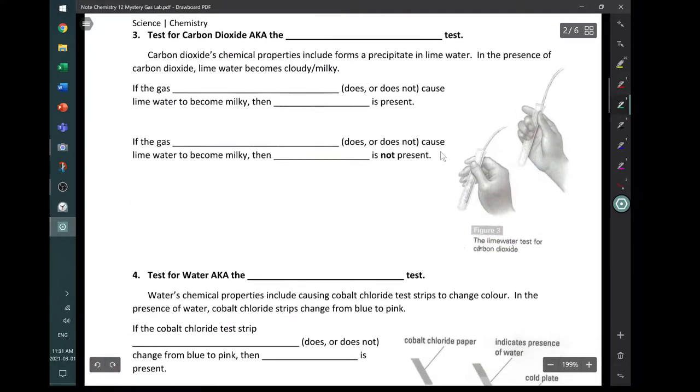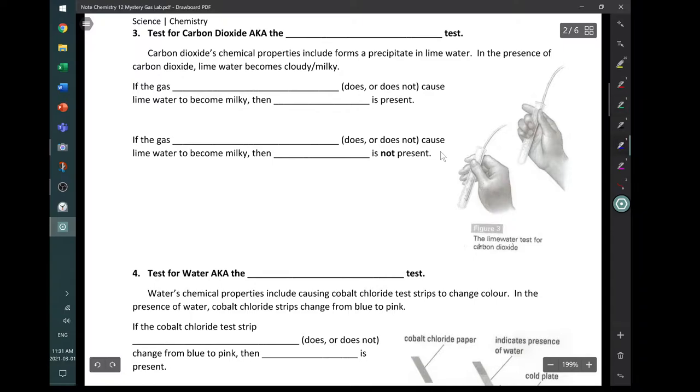There are other tests here, three and four. This is a test for carbon dioxide. This is called the lime water test. And they use something called lime water. Carbon dioxide's chemical properties includes forming a precipitate. A precipitate is a little solid. We would make this lime water go from a watery, transparent color to a milky kind of color. In the presence of carbon dioxide, we just bubble it through this lime water, and the solution becomes cloudy or milky. If the gas does cause lime water to become milky, then CO2 is present. If the gas does not cause lime water to become milky, then CO2 is not present.